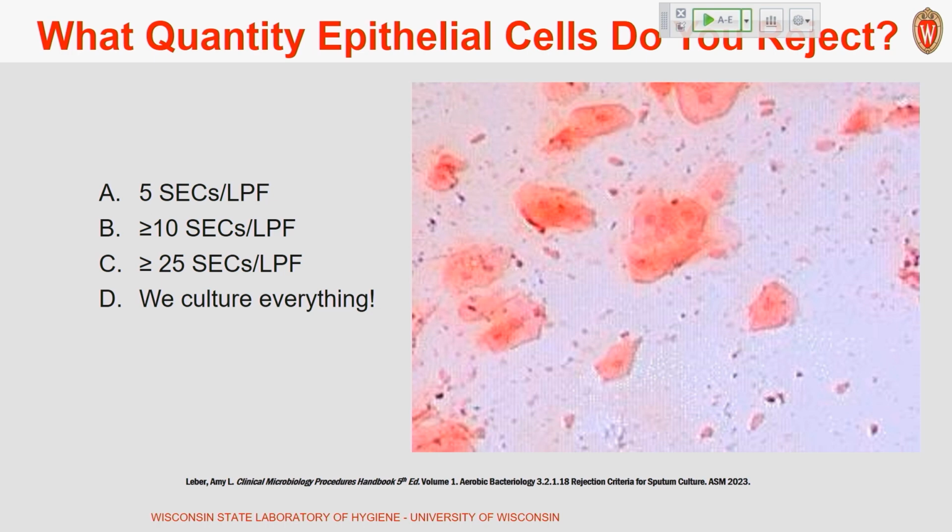I would be curious to see if anybody wants to raise their hand and acknowledge if you're also using a Q score method for sputum criteria acceptability. I see 1, 2, a couple people. In terms of deploying that, was that fairly complicated to learn and teach the team that process? No, it was just counting. Right in front of their scope is just, here's your score. If it's positive, then you accept it. So I guess it's maybe analogous to a Nugent scoring system on a vaginal gram stain, potentially.